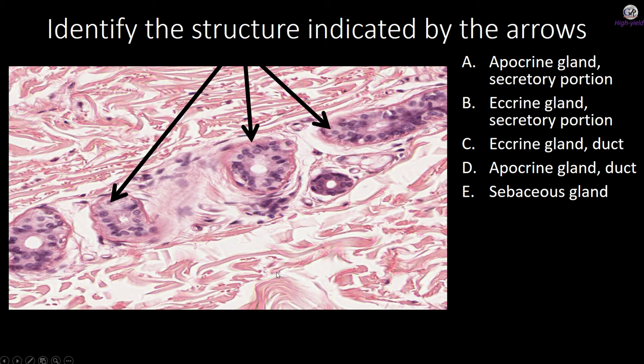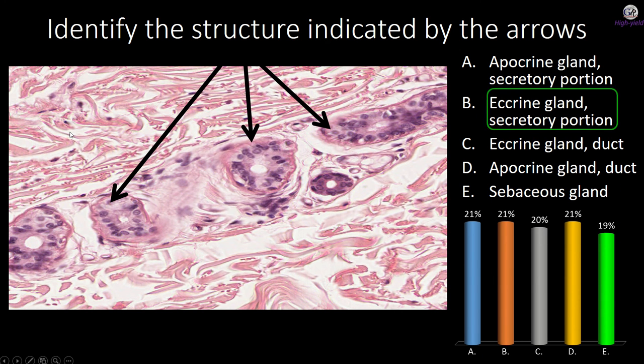And here you can see collagen fibers, little capillaries, every once in a while some blood vessels, fibroblasts in the connective tissue. So the cells that are making these fibers are fibroblasts. All right, great.